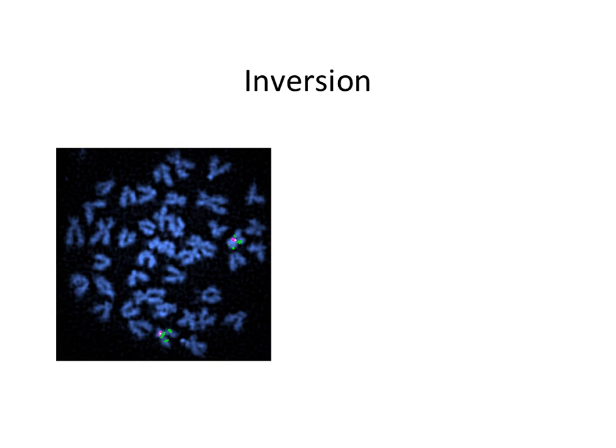Detecting inversions also benefits a lot from having multiple colors of fish probes. In this case, I'm going to diagram the 2 chromosomes that exhibit fish signals.